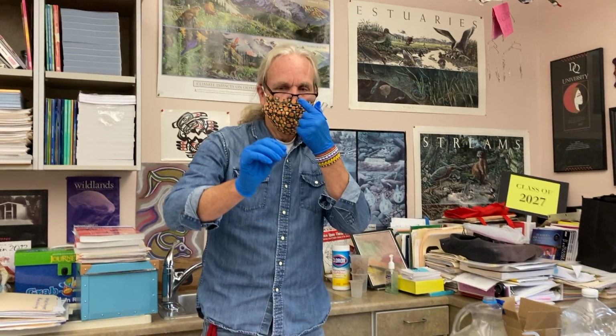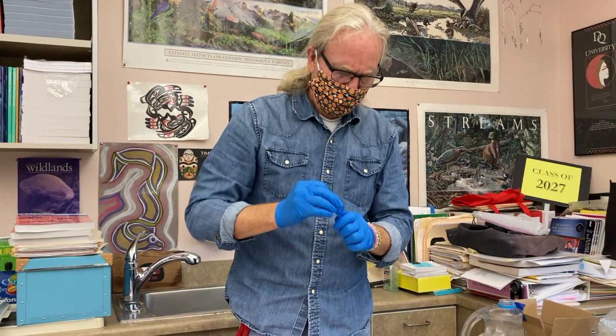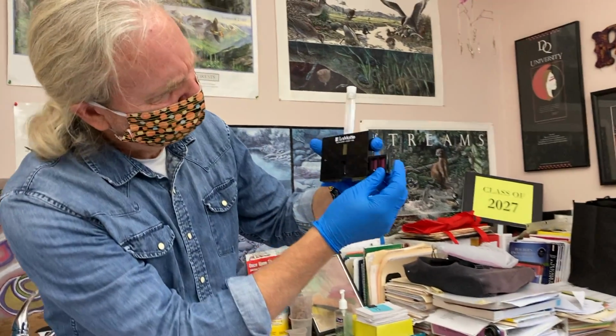All right, now we have the second chemical to add, which is also in pill form. I'm going to drop that in there. And we're going to do the same thing. We're going to let it dissolve, take a minute or two, and then we have to let it sit for 5 minutes before we put it into the nitrate colorimeter. Okay, so our sample is ready. It's sat for a little while.